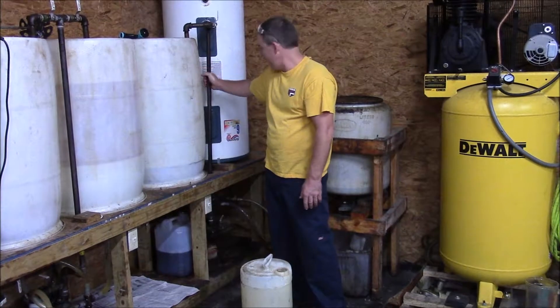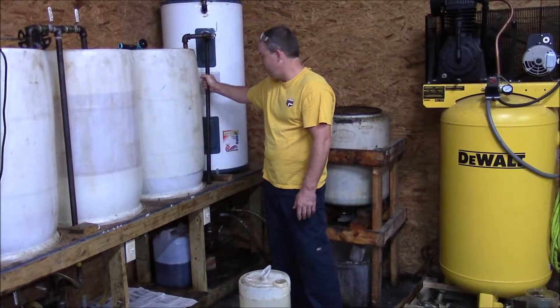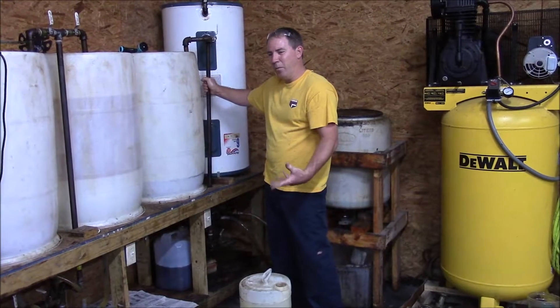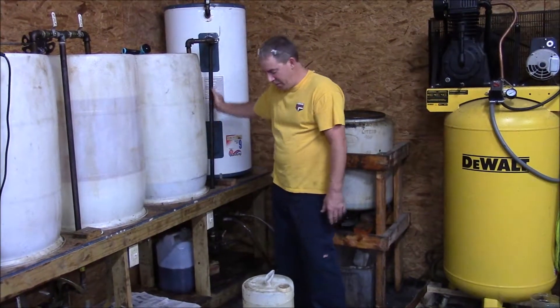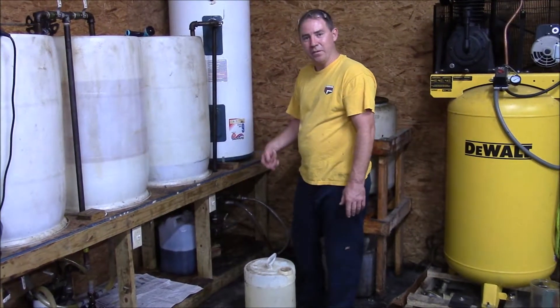We've got the heat on right now. I can hold this piece of metal, so I'd say we're probably at about 130 degrees. This temperature will actually go up a little bit when we bring the methoxide in.